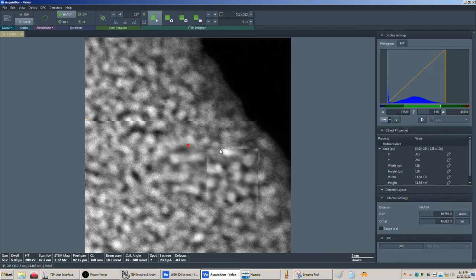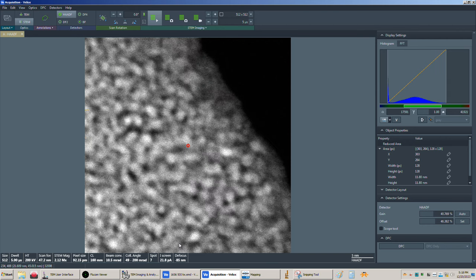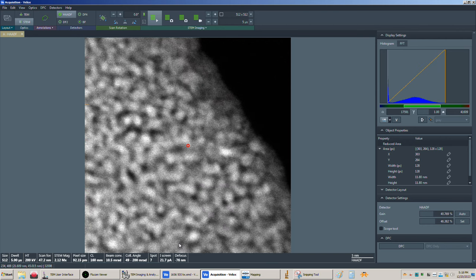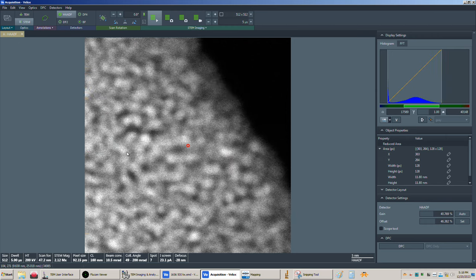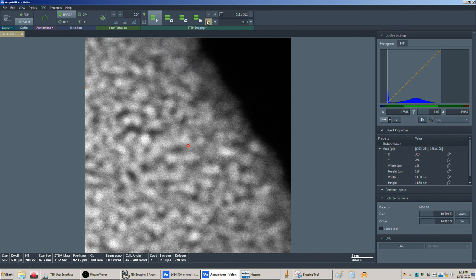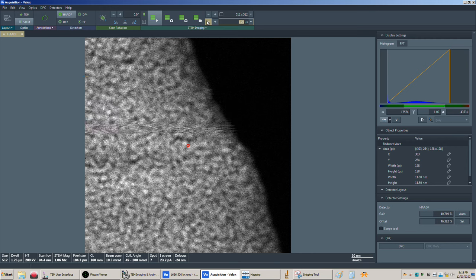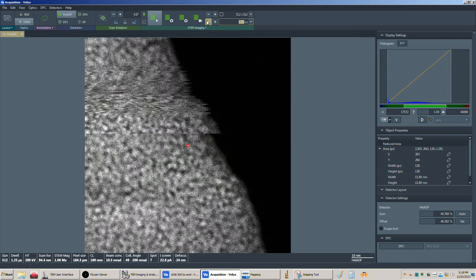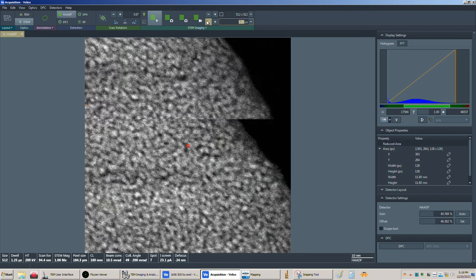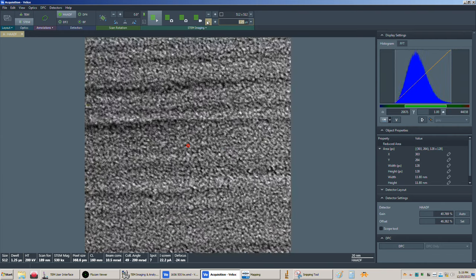If we wanted to really quickly, but again, my defocus is very low here. You want to keep this as low as you can, especially in STEM. In my opinion, this is a little more critical. You can see I'm already getting a little settling. So from here, depending on where you are in the sample, if your sample's not perfectly flat, you might need to do a lot of focusing with the Z. Let's see here. There's maybe a spot here.